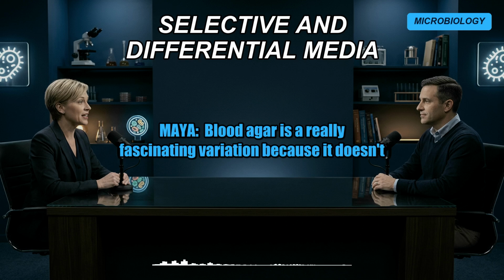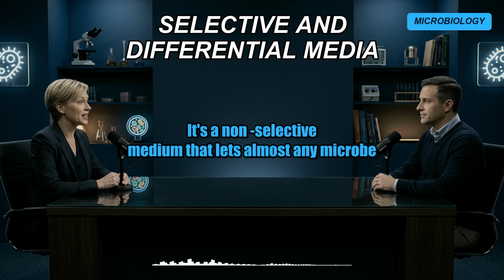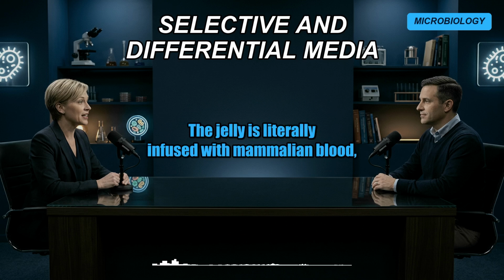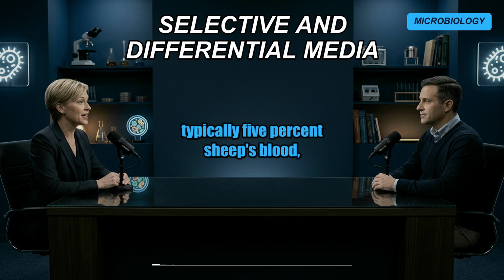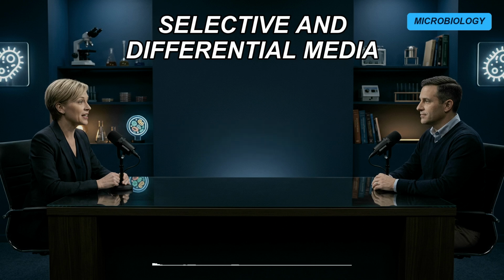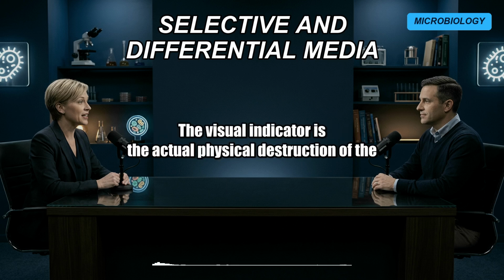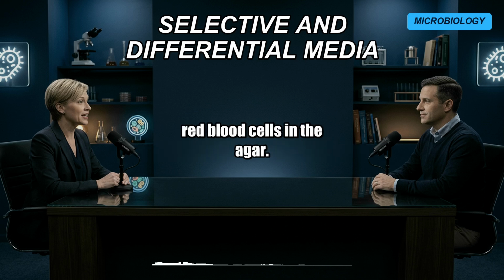Blood agar is a really fascinating variation because it doesn't use a bouncer at all. It's a non-selective medium that lets almost any microbe grow. But its differential power, its glow stick, is unmatched. The jelly is literally infused with mammalian blood, typically 5% sheep's blood, making the plate opaque and bright red. And the glow stick here isn't a chemical dye turning pink or yellow. The visual indicator is the actual physical destruction of the red blood cells in the agar.